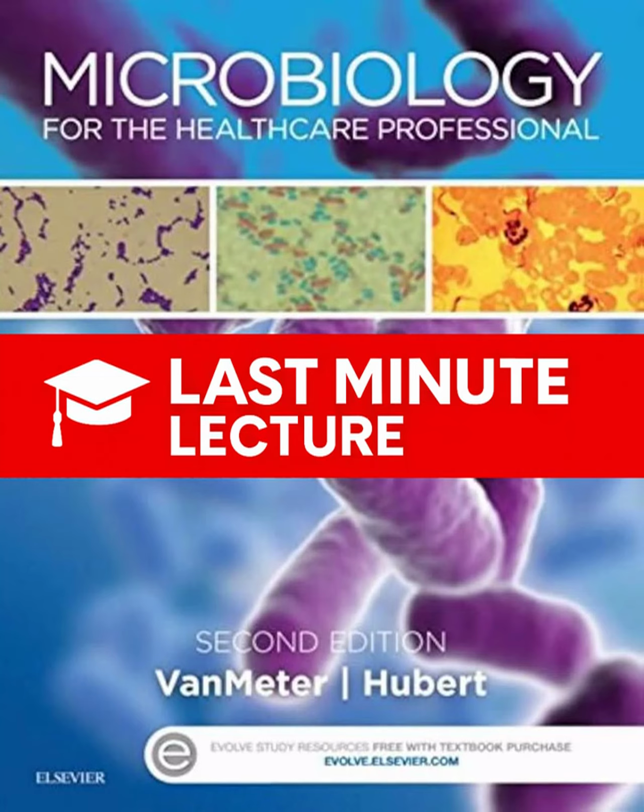It means being almost obsessive about the details. You've got to control air currents, so keep doors and windows shut. You need to manage fomites, too. Fomites. Those are the inanimate objects, right? Benchtops, equipment. Exactly. Things that can carry germs. And the sources give really concrete examples, like sterilizing your loops and needles, the little tools you use, in a flame or incinerator, before you use them and after, every single time. And another key thing, flaming the mouth of a test tube or flask when you open it to transfer stuff. That quick blast of heat creates an upward current. Helps keep airborne things from just falling in.